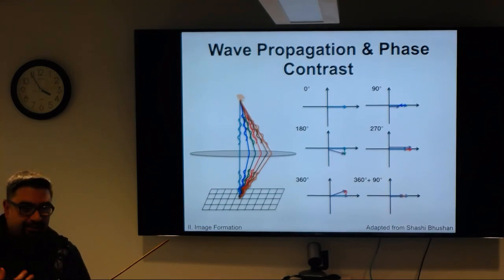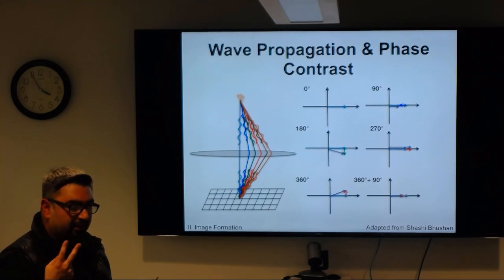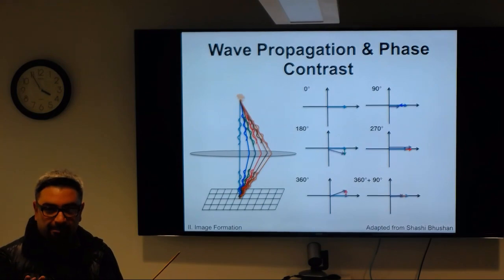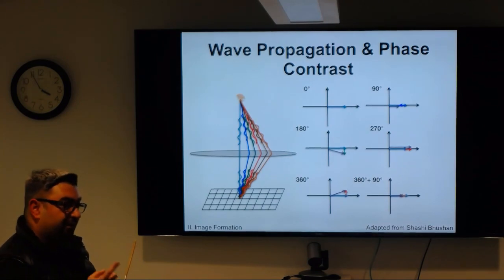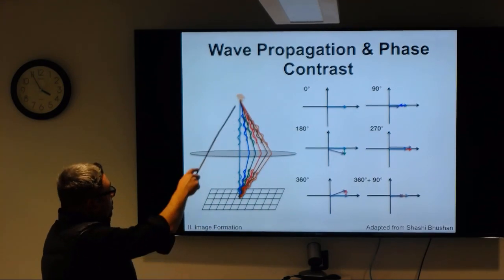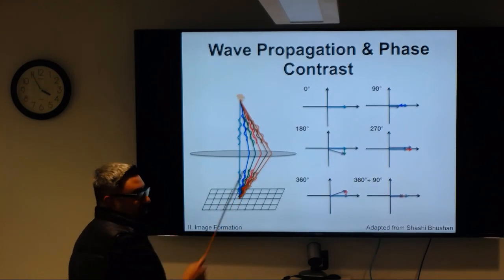Okay, so in Grant's lecture, he talked about the phase shift coming from two places, right? One was the path length. The second was a 90-degree shift. So all these phases have the 90-degree shift on top of the path length. What I'm showing here is the degree path length. So here would be 0.